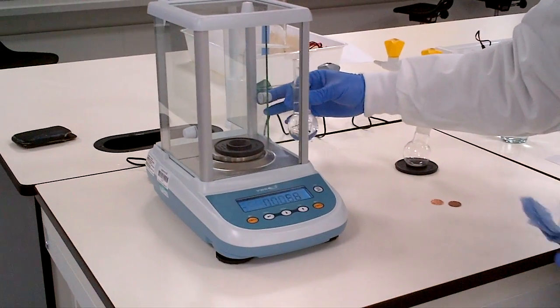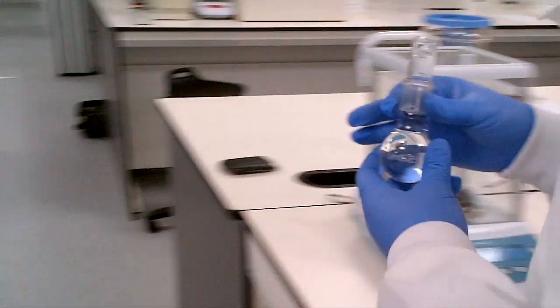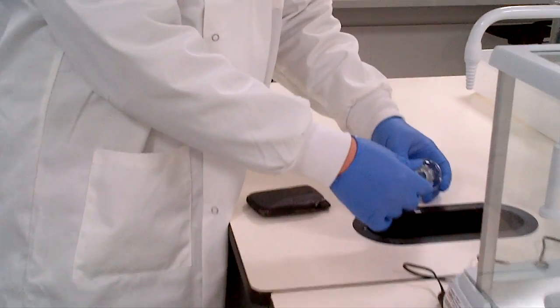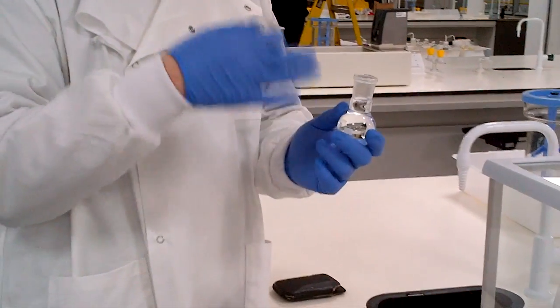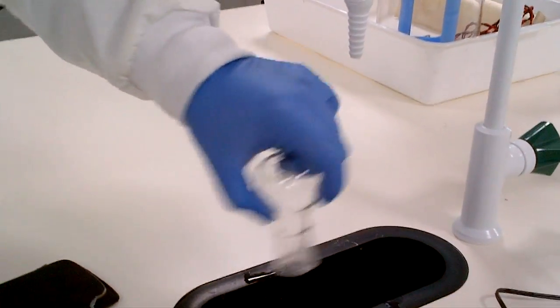So what do we do with this? This is just water, so this could be poured down the sink. Now, if we changed the practical in time and this became an organic solvent, this would then go into the organic waste. You'll see this in a moment, but water can just go down the sink.